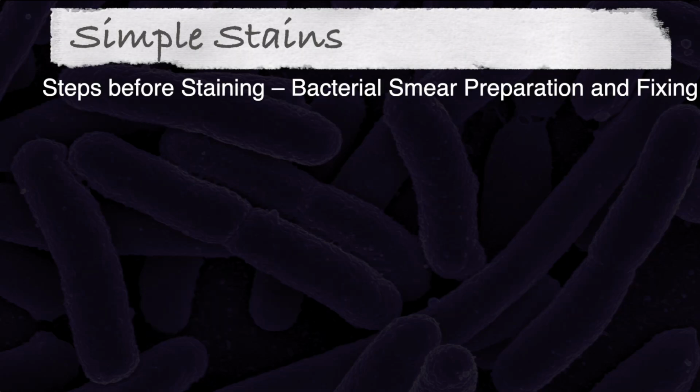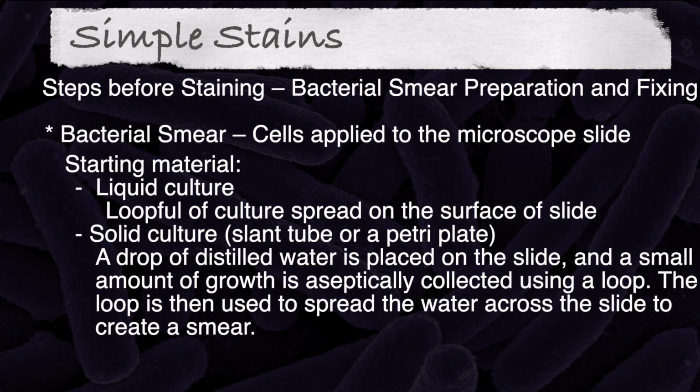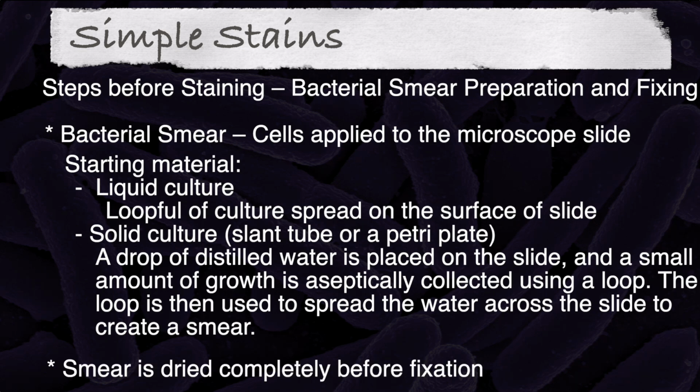Before staining, you must prepare the bacterial smear and fix it to the slide. To create the bacterial smear, cells are going to be applied to the microscope slide. Your starting material could be a liquid culture, in which case a loop full of culture is spread onto the surface of the slide. Or it could be a solid culture, for example a slant tube or a petri plate, in which case a drop of distilled water is placed on the slide and a small amount of growth is aseptically collected using a loop. The loop is then used to spread the water across the slide to create a smear. The smear is then dried completely before fixation.